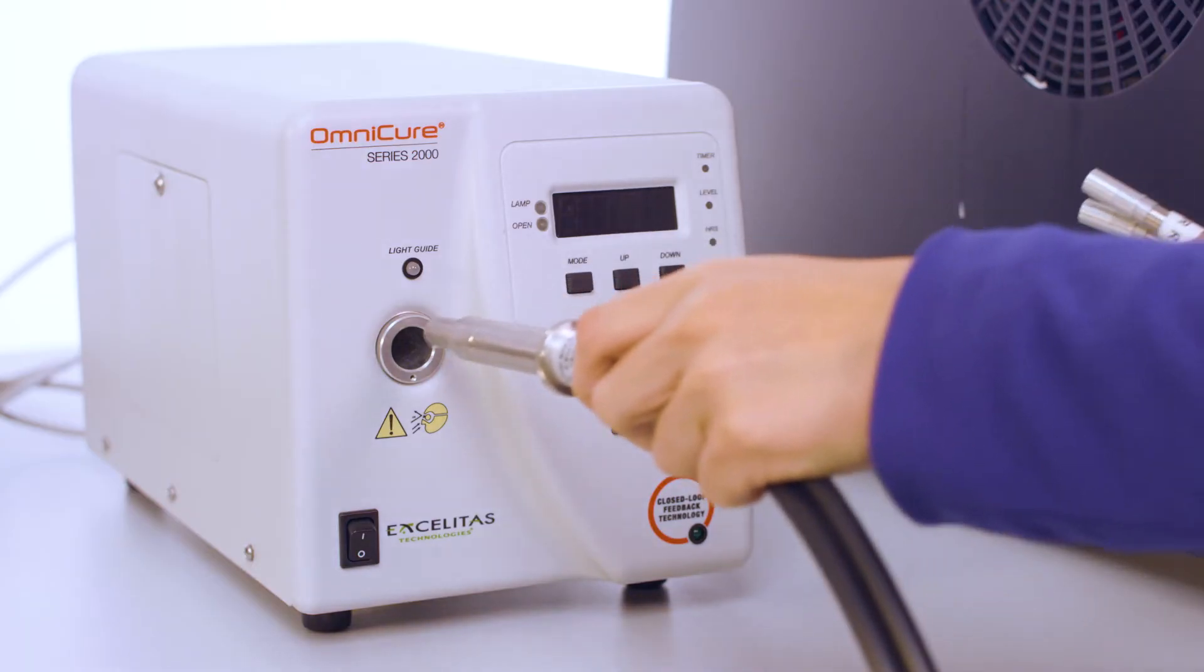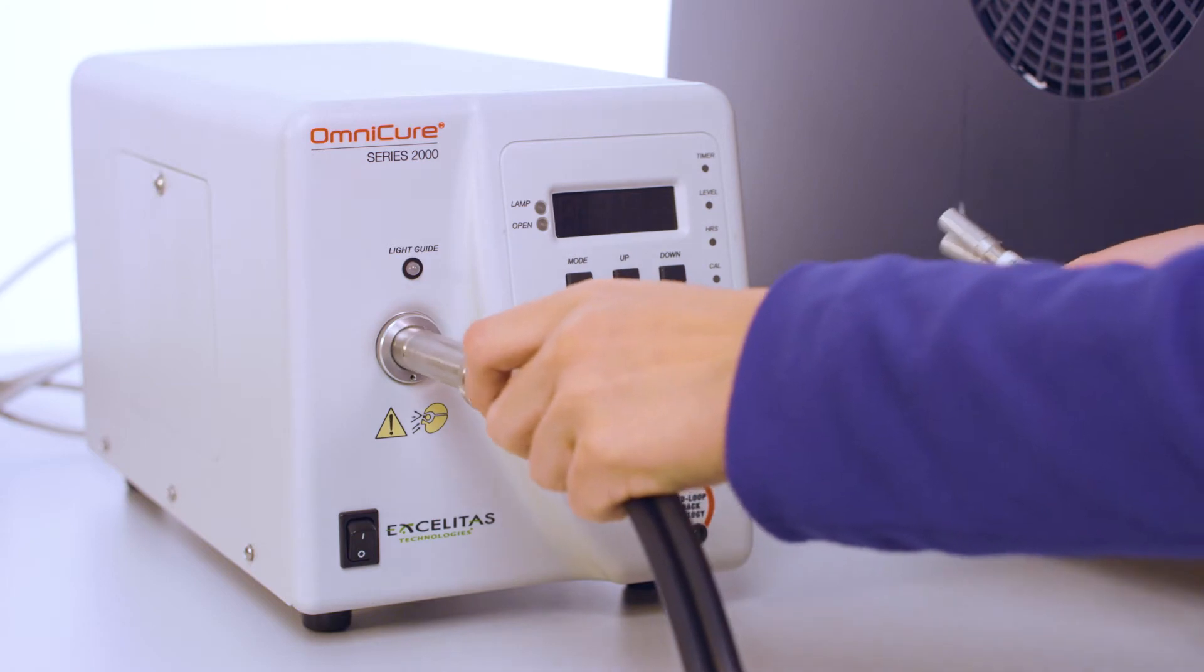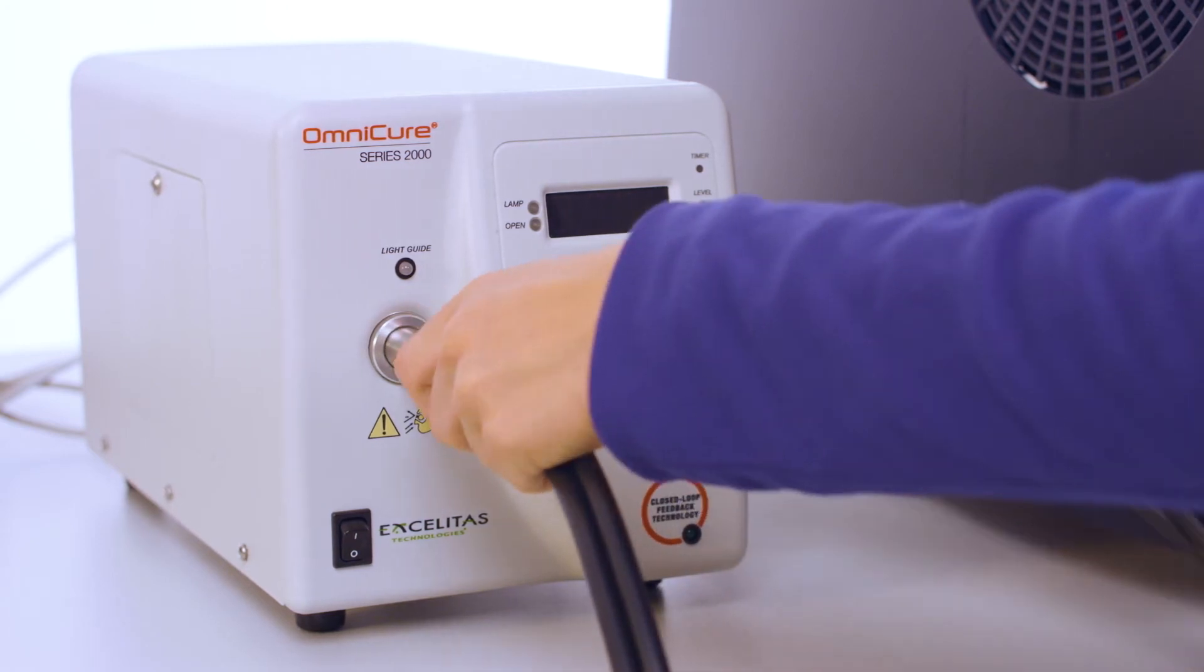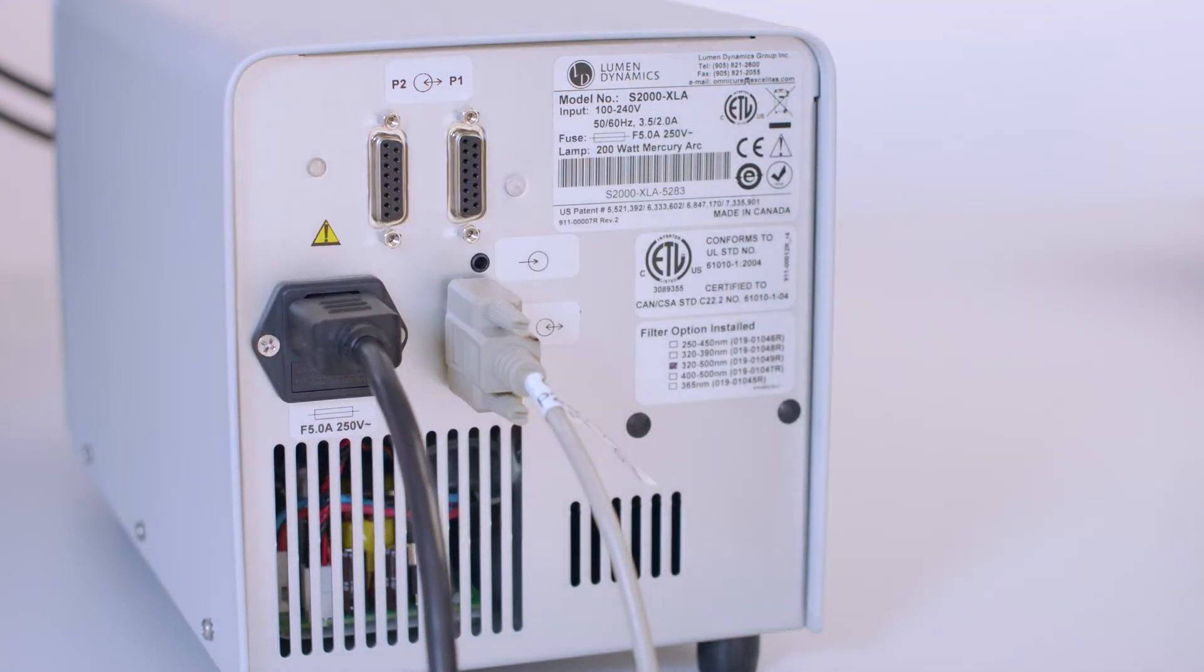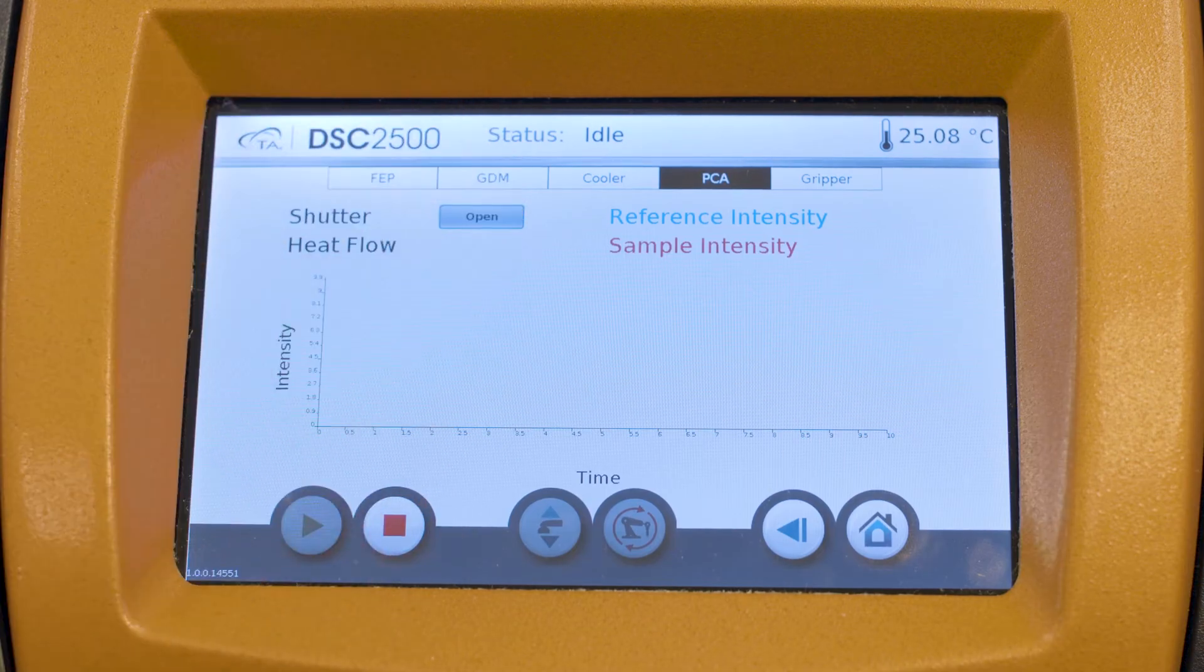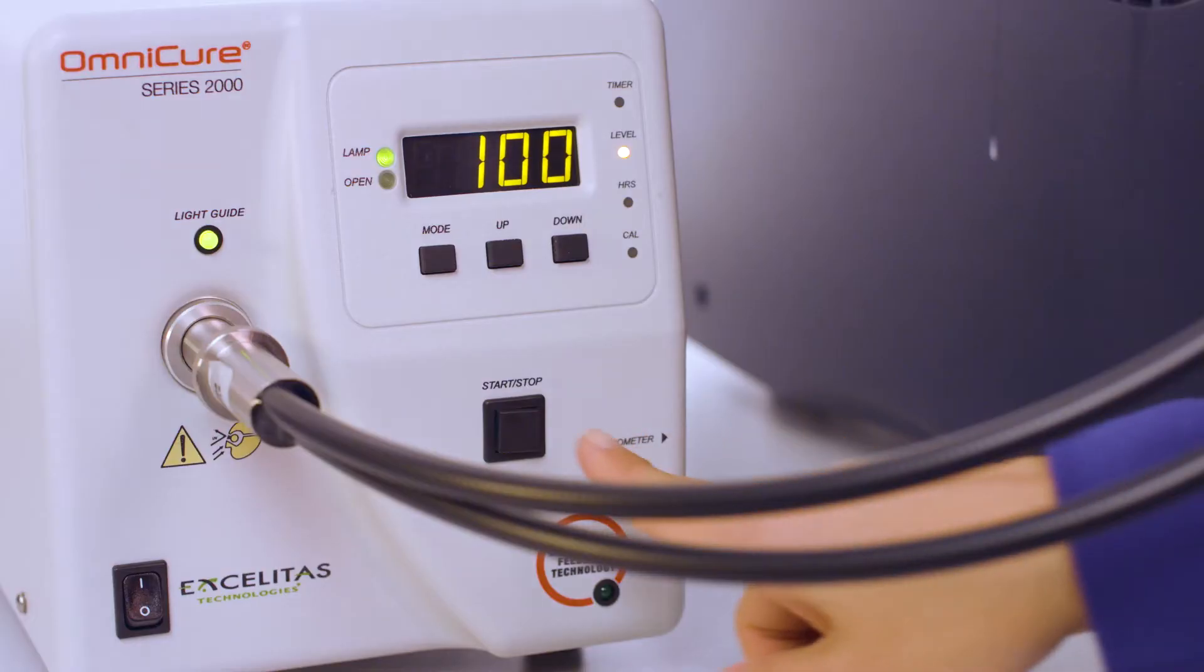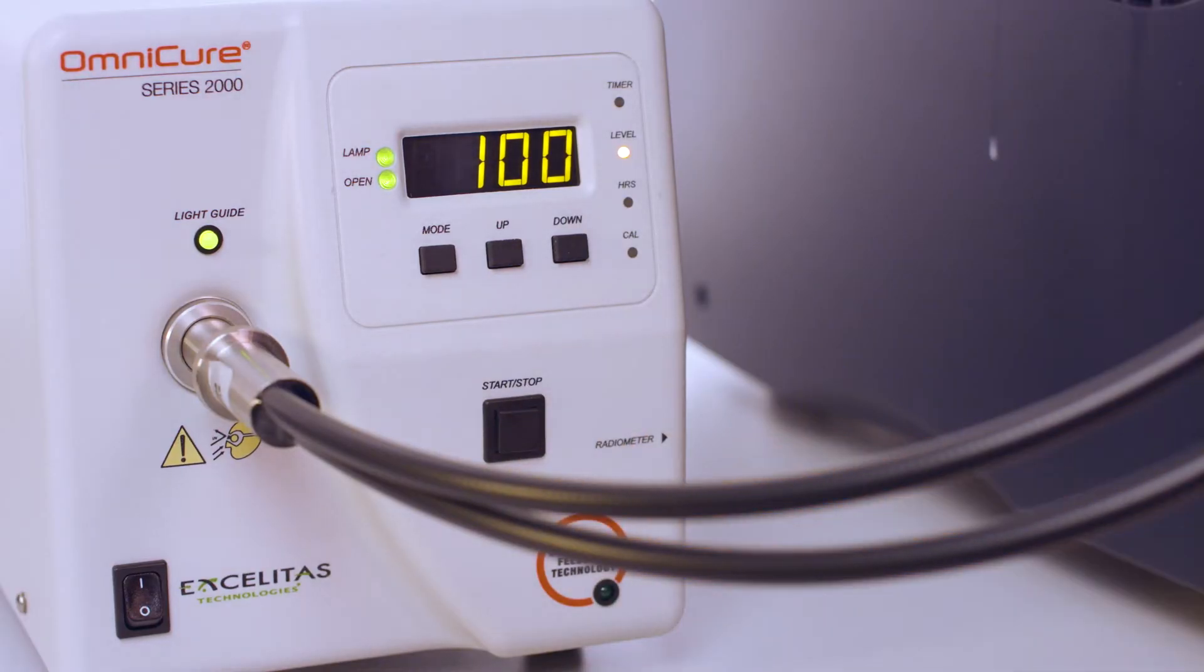The PCA is connected to the DSC instrument via cable that opens and closes the shutter at the light source. When setting up a PCA method, PCA shutter open, close, or a PCA exposure segment can be used.